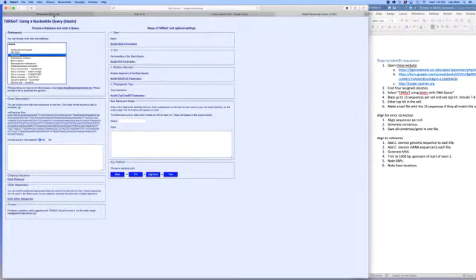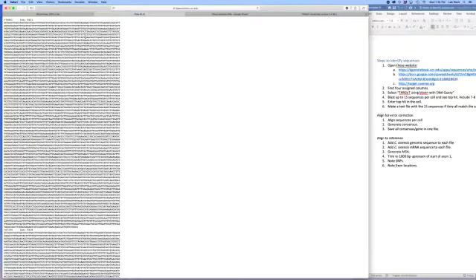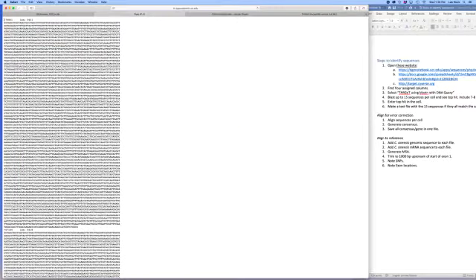And so what that's going to allow us to do is to verify or fix what sequences are in these different cells or wells. So what you're going to need to do, for each well, or cell here, whichever you want to call that, for A1, which is a particular gene and a different citrus variety, and A2, same gene but different variety, you want to take 15 of these and blast them using this Target tool.